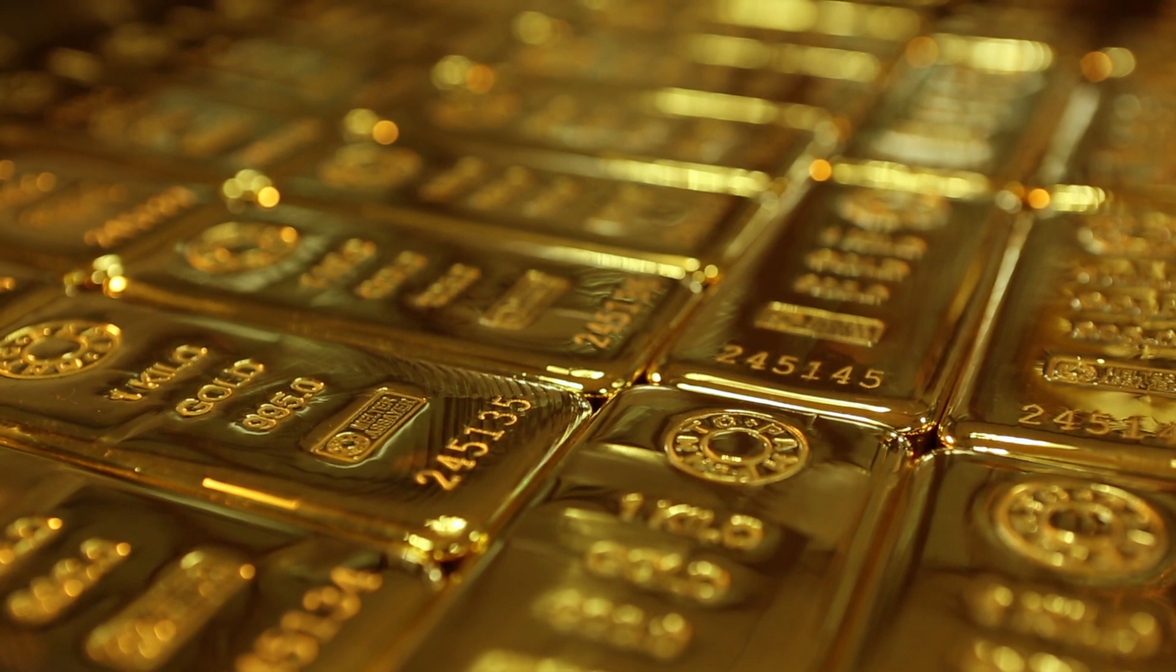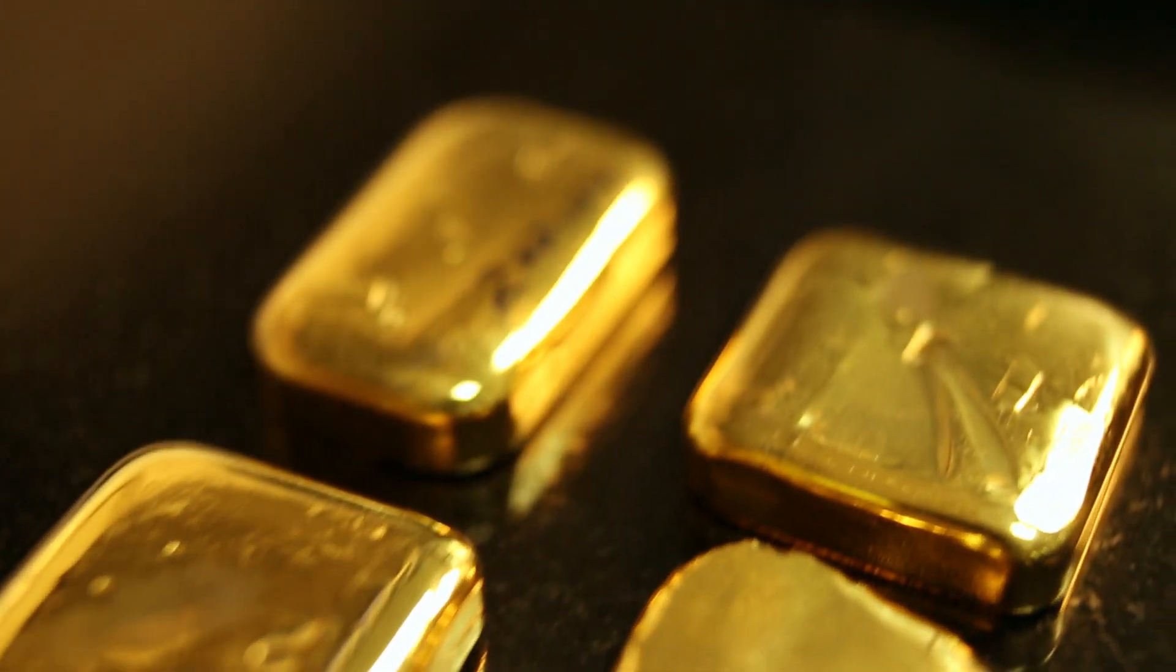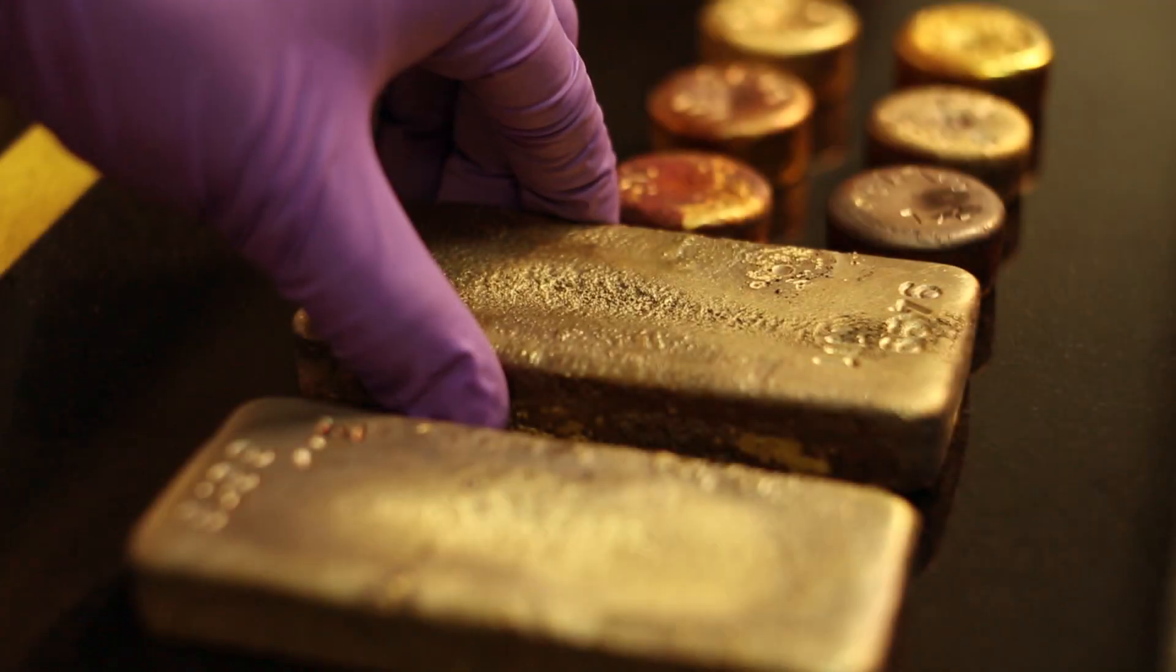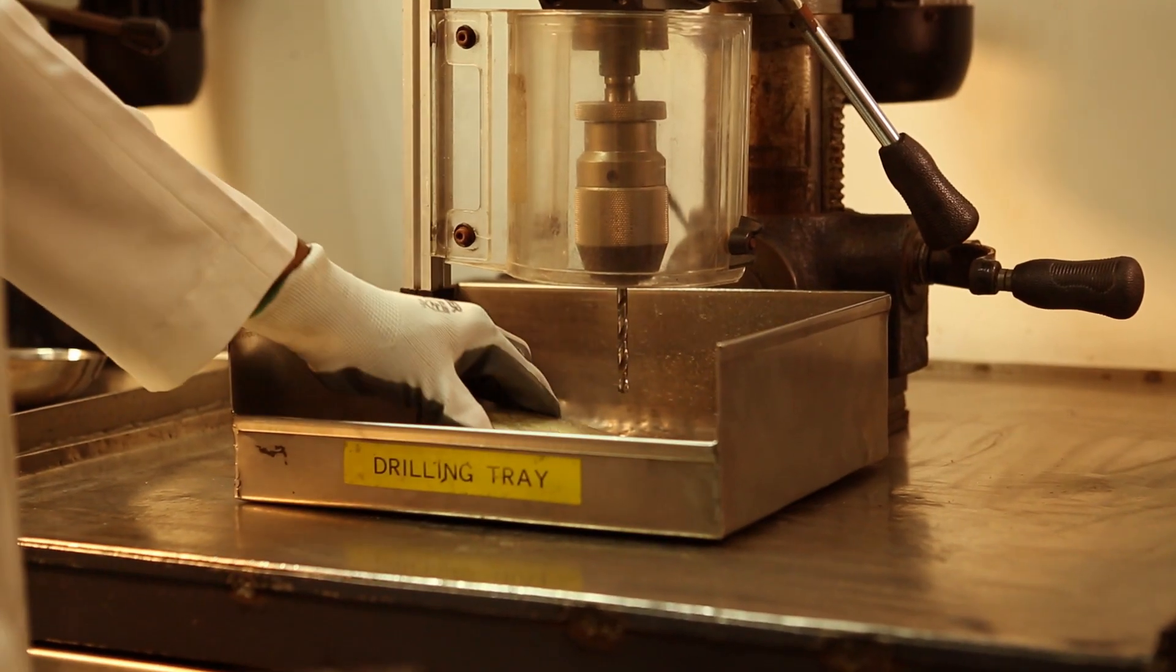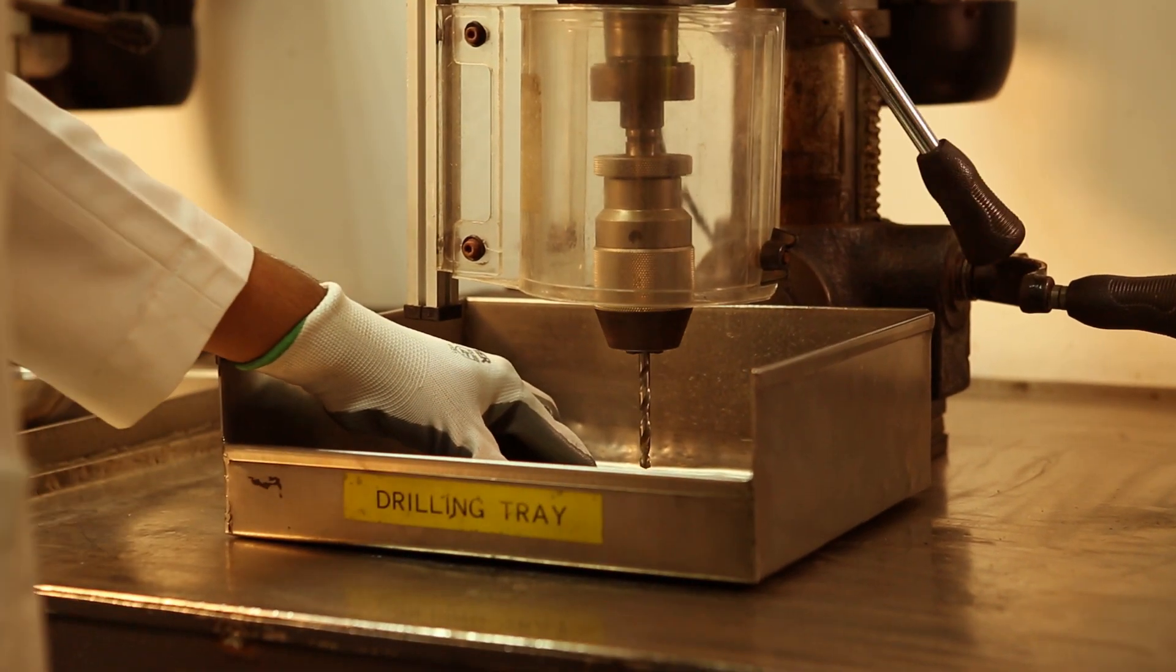Purity can be accurately determined by the process of assaying. Let's find out how exactly it all unfolds. We'll begin with the oldest known method of assaying gold, fire assay.